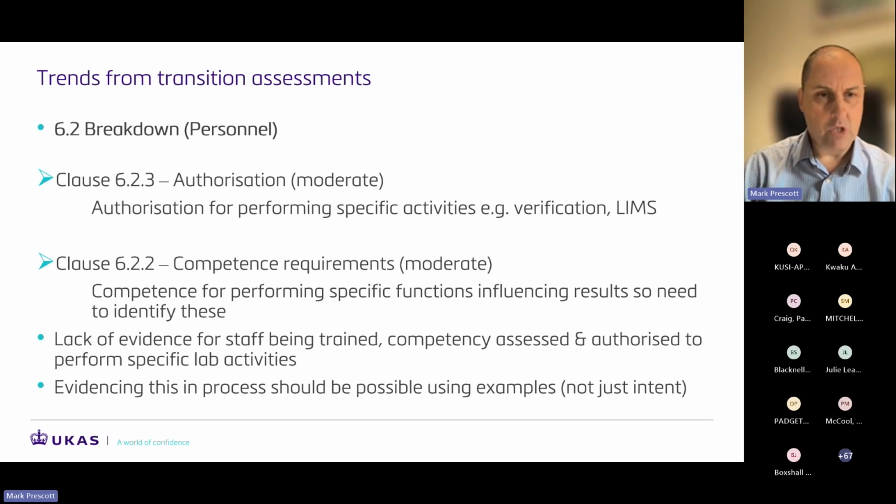In assessments so far, we're seeing some lack of evidence for staff being trained in some of these activities. This really requires some of the competency assessment records to be updated, and laboratories to identify any activities where they currently don't have any formal records of training and competency assessment. I do think this is one area where we could actually demonstrate that it has been implemented. Obviously, laboratories are updating competency assessments quite frequently, so it should be possible for labs to show that this has been implemented and not just intentional. So I think this could be why we are getting a number of non-conformities in this area.